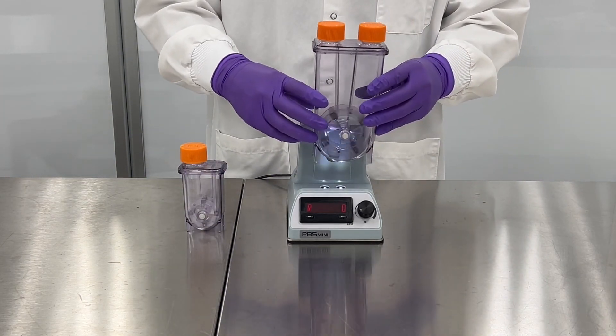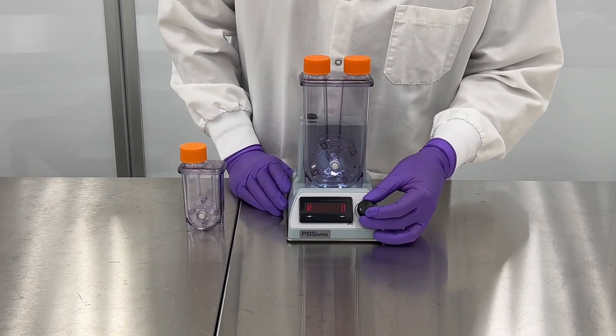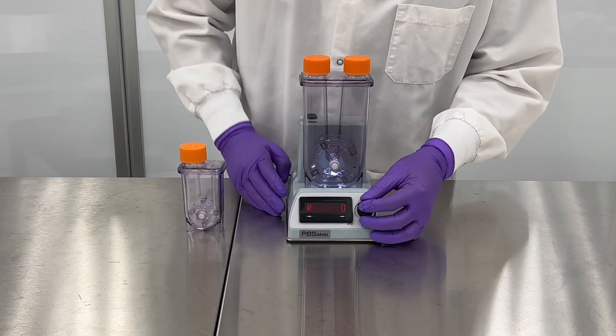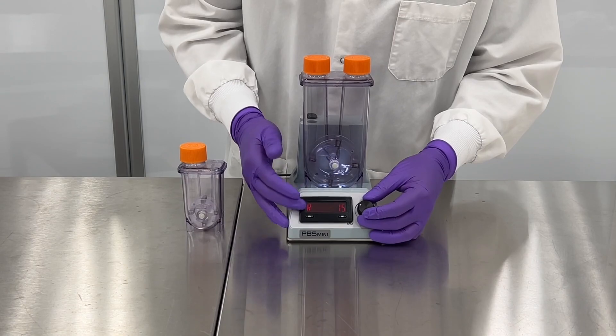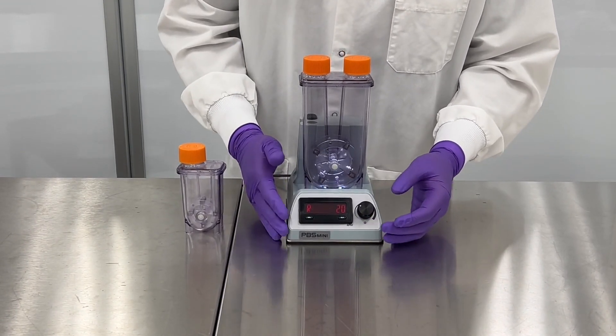We have the same dovetail feature on the 0.5 so that'll go in there and then we can see if I keep turning my speed adjust dial it not only activates it now we start to activate the RPM. So this RPM range that we have is generally between 5 and 100 RPM.